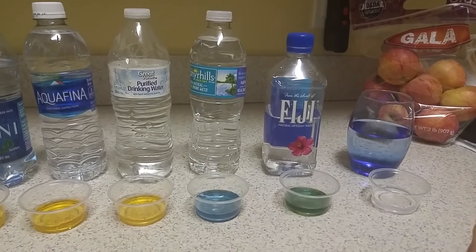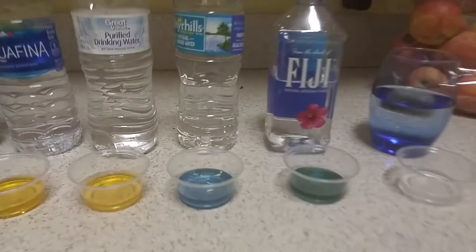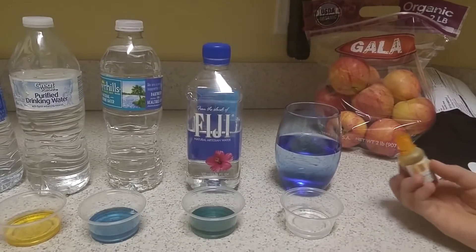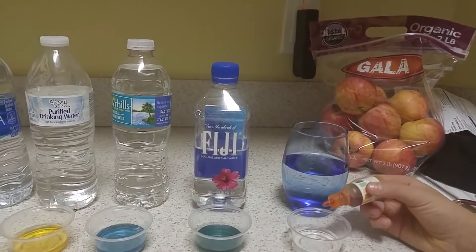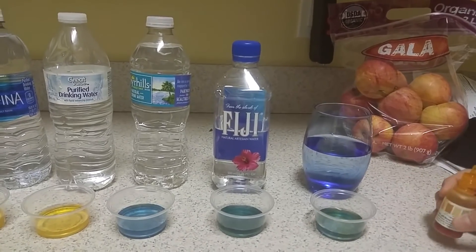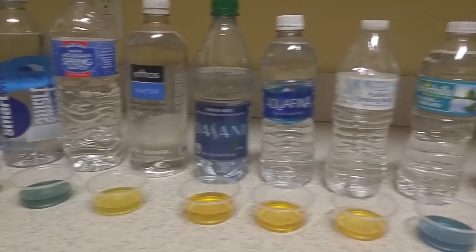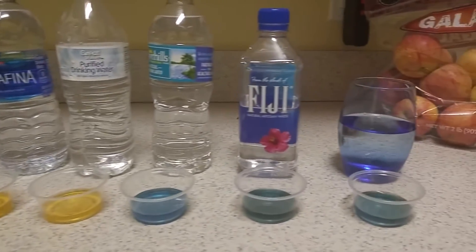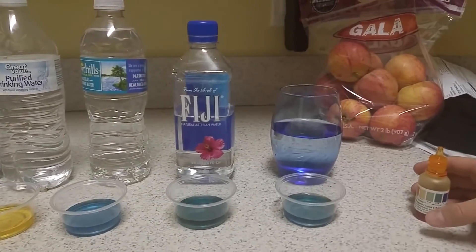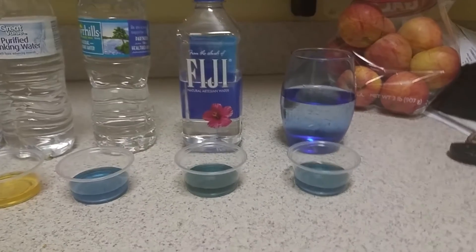Fiji. That's dark — around an 8. Good job, Fiji. And this last one is Florida tap water. Florida tap water is definitely better than some of these bottled brands. That's like at Fiji's level. Fiji's a little bit darker, but it's definitely better — it's at an alkaline level, a little bit above neutral.